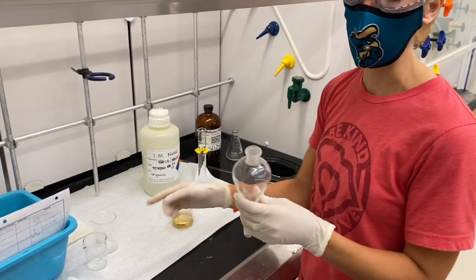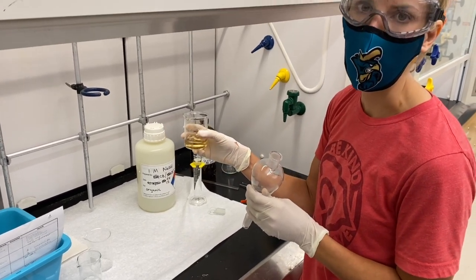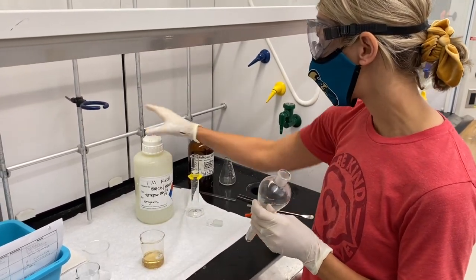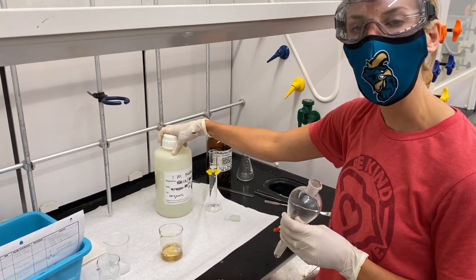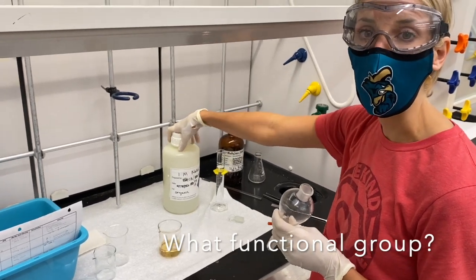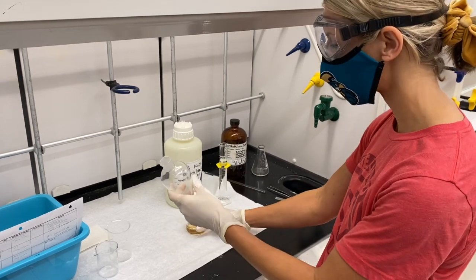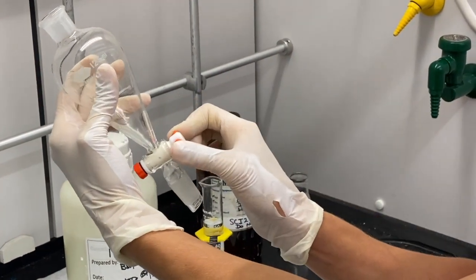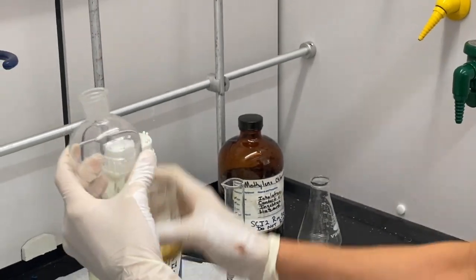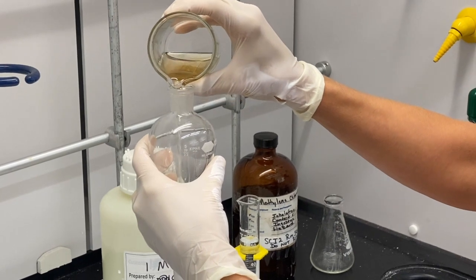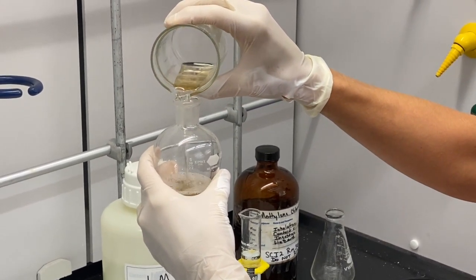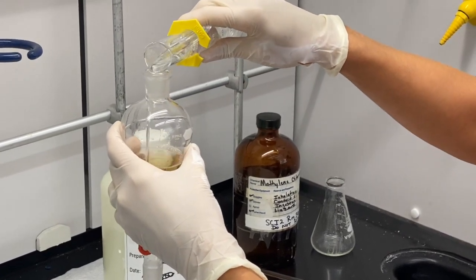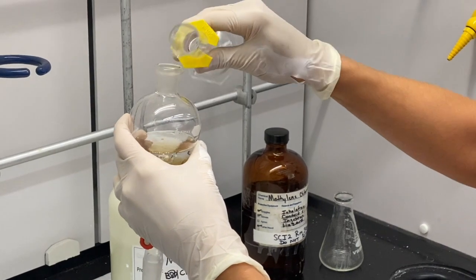We've separated our sucrose at this point, and now we've still got two compounds in this solution, in our dichloromethane or our organic layer. We've taken 50 milliliters of sodium hydroxide, and we're going to use this to manipulate one of the functional groups on our resulting two compounds that are in our organic solution. We're going to extract our dichloromethane using a separatory funnel. I'm making sure that this stopper is in the closed position so our solution doesn't run to the bottom. I'm going to pour our organic solution in here very carefully.